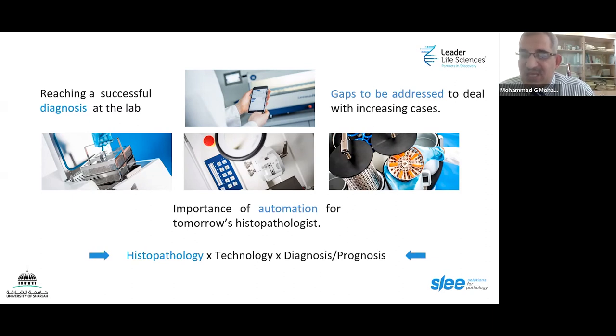The same for the staining. Definitely, the staining, by the way, is tricky because dealing with the stains means that you need to look for the age of the stain, the expiry of the stain, the preparation, whether there is dehydration, oxidation, and many other factors for the staining.